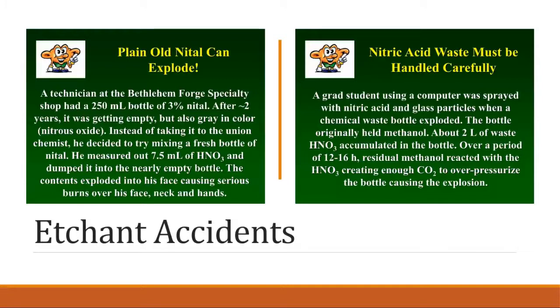About 2 liters of nitric waste had accumulated in the bottle, and over a period of 12 to 16 hours, the methanol, which is what you use nital with, reacted with the nitric, creating enough carbon dioxide to overpressurize the bottle, causing that explosion. So he wasn't even using chemicals. He was just sitting next to the fume hood on his computer, and it injured him.